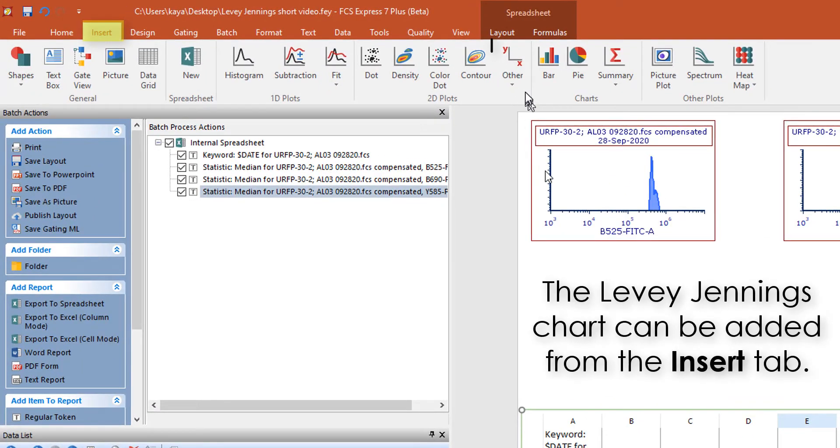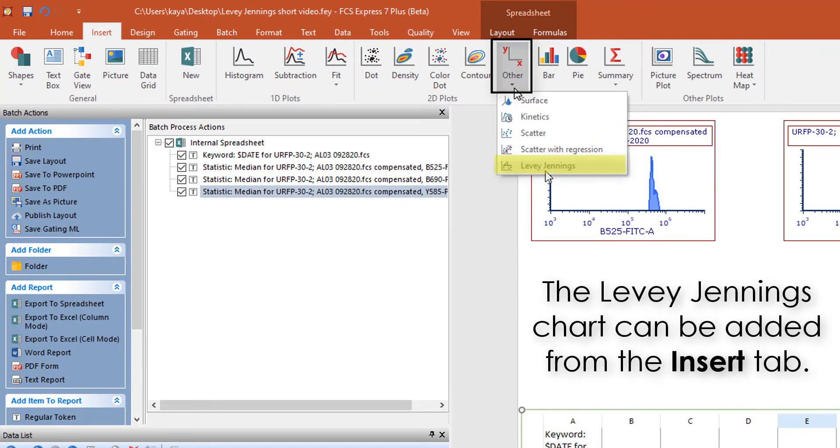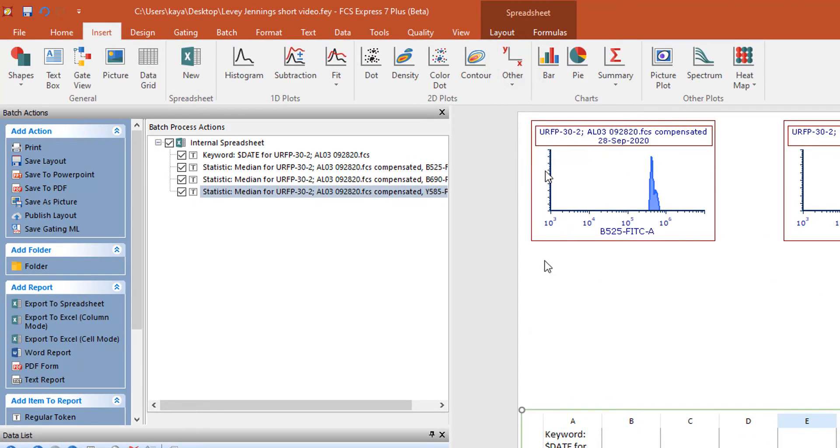From the Insert tab, click Other, Levey-Jennings, and click once on the layout to insert the plot.